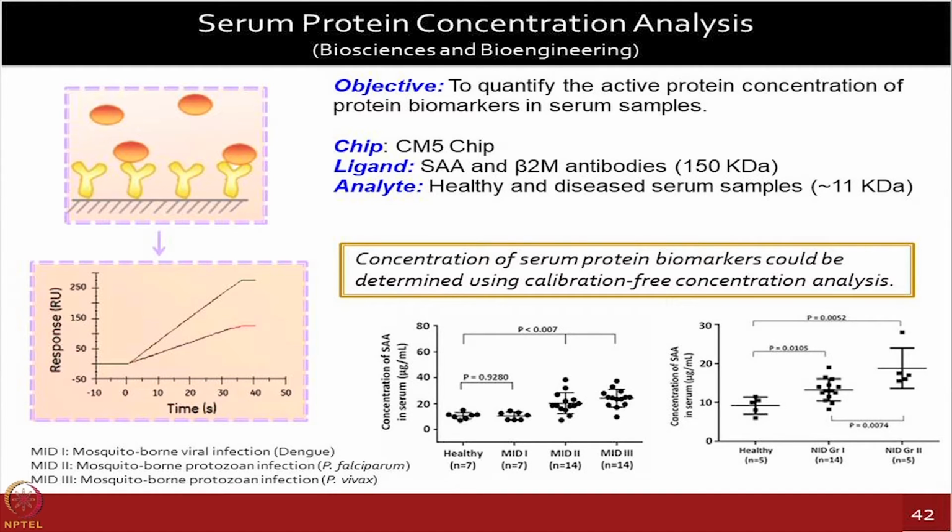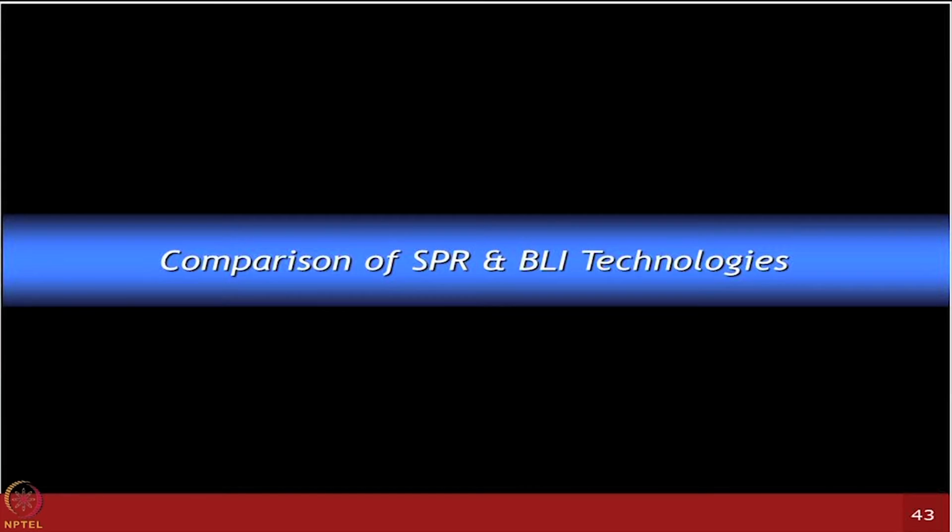You cannot do validation on a large number of samples using mass spec or other types of technologies. So then you have to come down to either ELISA or these kinds of label-free approaches, which can do screening of the same molecules in a very high throughput manner. So this was a good experiment for us to show that we can actually measure the concentration of this protein of interest. Sometimes you have to develop these assays in the beginning, so you need pure protein. It's a good idea to try out something if you are planning to do these kinds of experiments with known proteins for which you have purified proteins available. Build the confidence and the assay conditions from those, then you can apply them to unknown compounds as well.